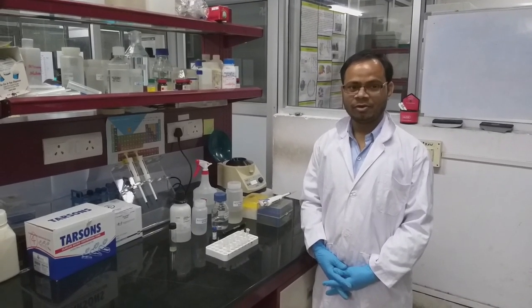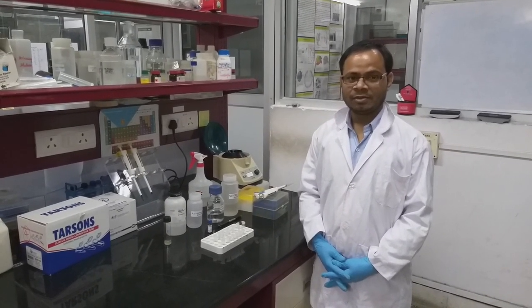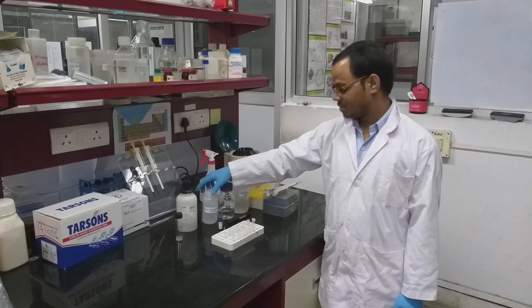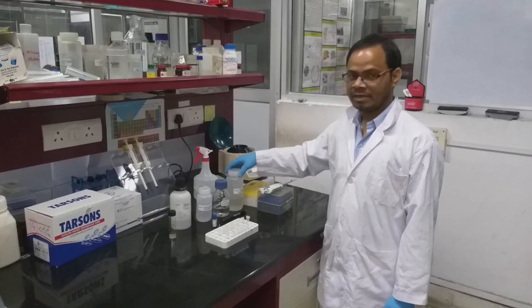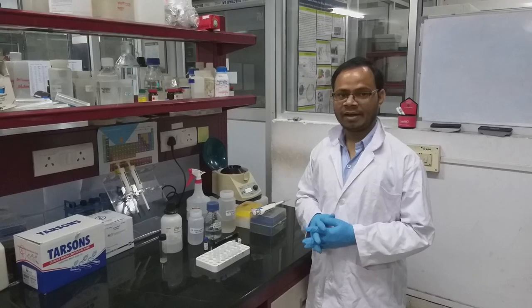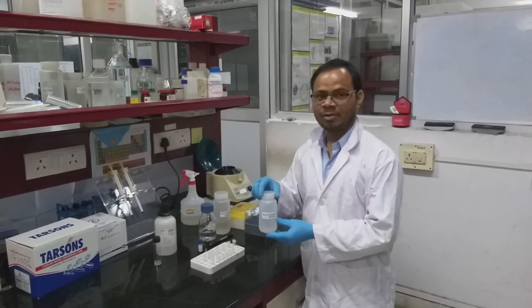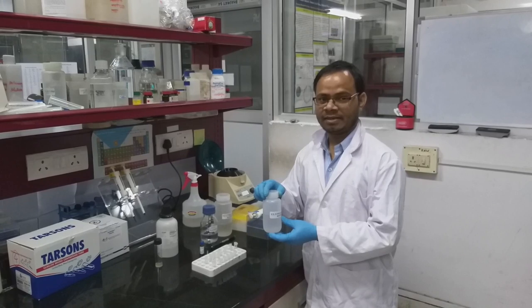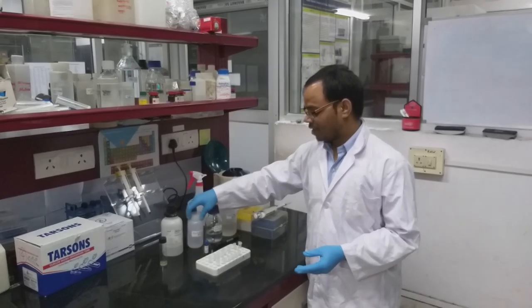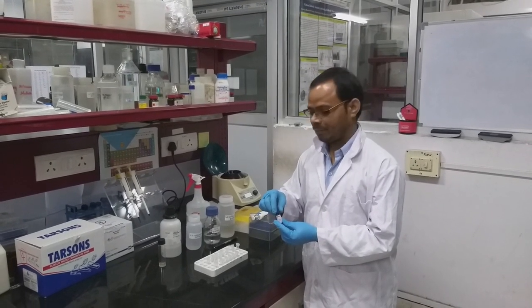Hello everyone, in this video we will show you how to isolate plasmid DNA using the alkaline lysis method. For preparation of plasmid DNA, we need resuspension buffer, lysis buffer, and neutralization buffer. In addition to that, we need isopropanol, RNase, and ethanol. Resuspension buffer contains 25 millimolar Tris and 10 millimolar EDTA, and we have to add RNase at a final concentration of 100 microgram per ml.